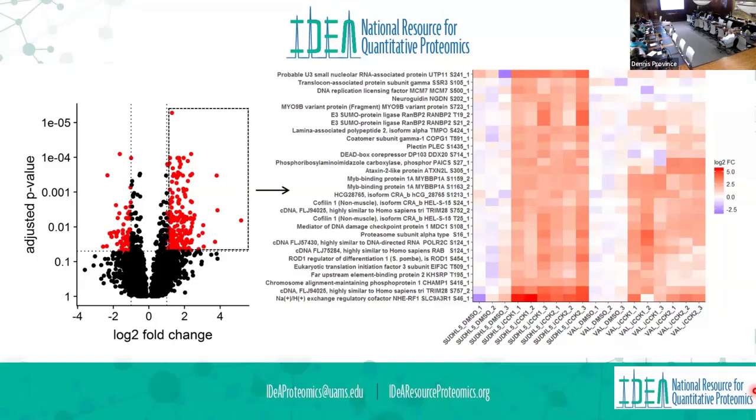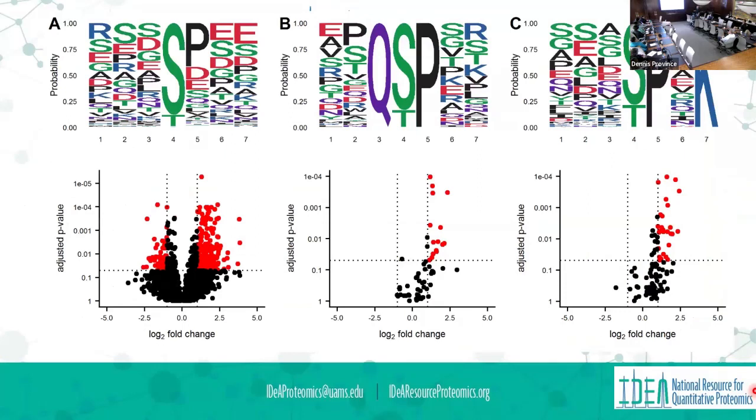It's similar anyway. So we can look at the phosphopeptides. We can generate heat maps. One of the things that I really liked about this past version was you could look at upregulated phosphopeptides and look at the motif calculation and see if there's a particular kinase motif that you recognize, or if you're upregulating a kinase, you should expect to see a certain amount from that, but you might see other sites upregulated as well.